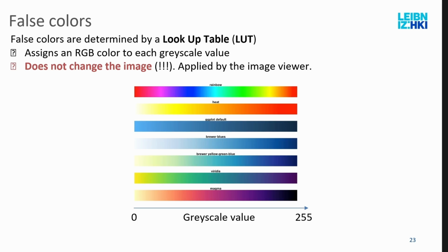And generally what they do is they assign to a grayscale value, generally limited to 0 to 255 for performance reasons, an RGB value, and then they display it on screen only. If you have a 16-bit image, depending on the tool that shows it, it may internally convert it first to 8-bit. So this lookup is fast, because looking through a table of 255 values is way easier than a table of 65,000-something values, and it's also smaller.